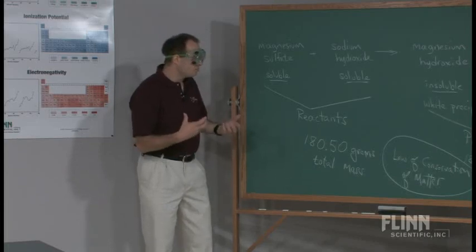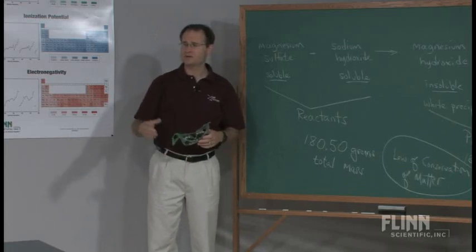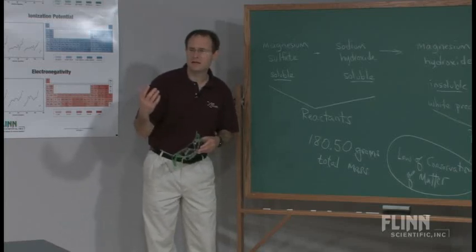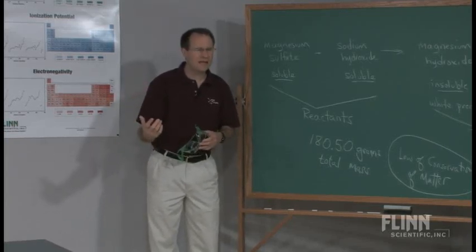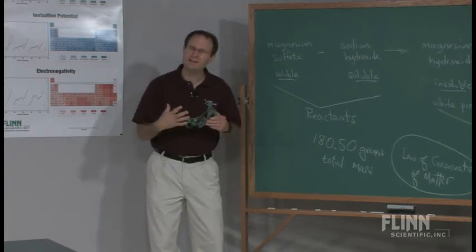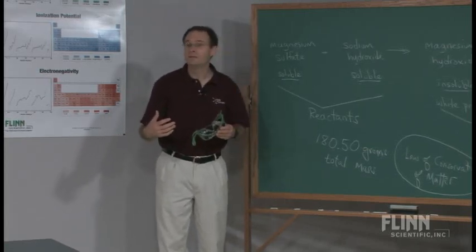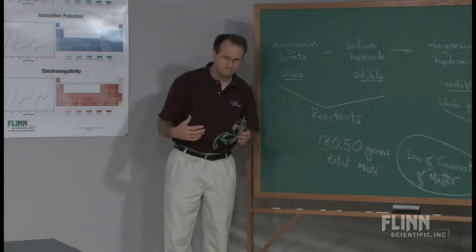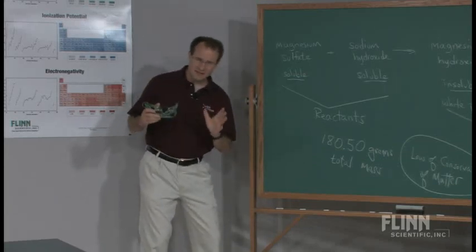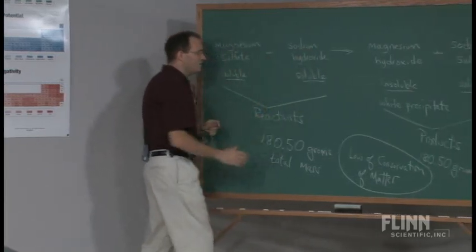But asking them to predict is what we're playing with in terms of the educational research that supports this. If we listen to what our students say, they'll say solids are heavier. Gases are light and fluffy, but solids, they're chunky. Maybe buzzwords like density, the density is greater. But if we focus just on the mass, we can say, well, this does make sense to us. All the magnesium combined with the hydroxide.